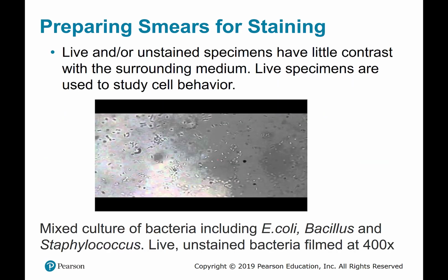Now you can view live specimens using a compound microscope. You can also view unstained specimens. However, as I mentioned, they're going to have little contrast with the surrounding medium. But if you want to study live specimens, you can study their behavior.